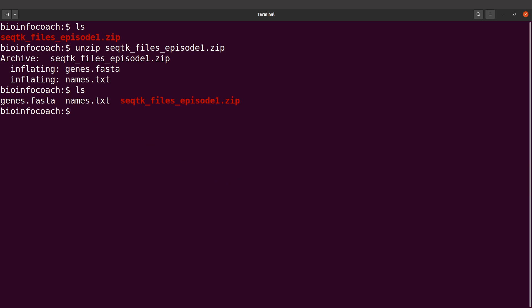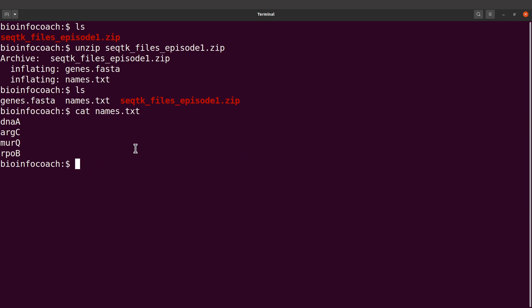Now we are going to write our bash scripts and then extract the sequences. But before that, let's display the names again — we have them here. This is the FASTA file; you can also take a peek into it. So now we are going to write the bash script, and in that script we will specify the names of interest.